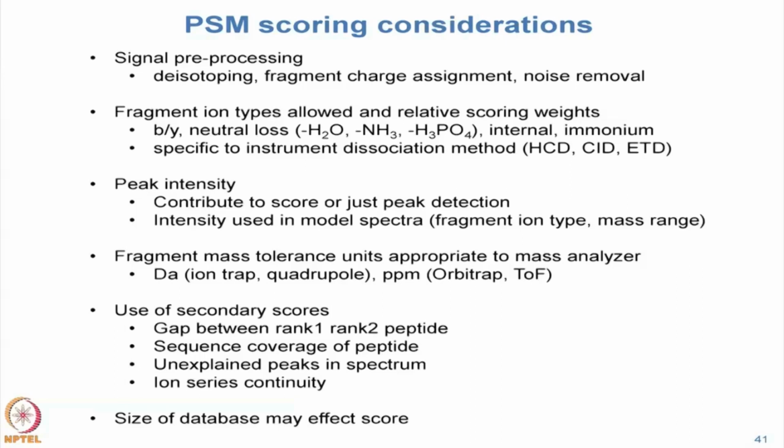When you design the algorithm, you have to know what fragment ion types are possible. When you start to use a program, you often have to choose what instrument type was used to generate that spectrum. When you've done that, behind the scenes it's consulting a configuration file that has appropriate things like what ion types are possible for that instrument and potentially some different scoring values for the different ion types. Then, your algorithm not only has mass information, it has intensity information.